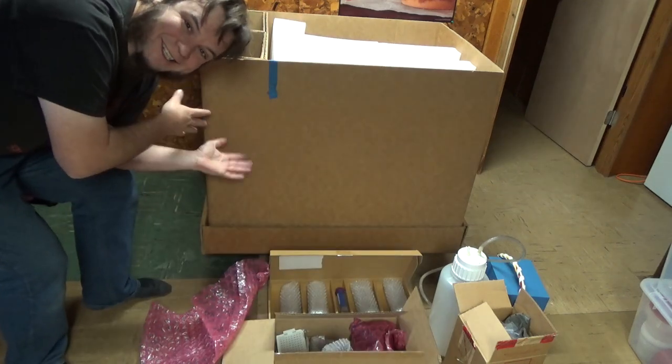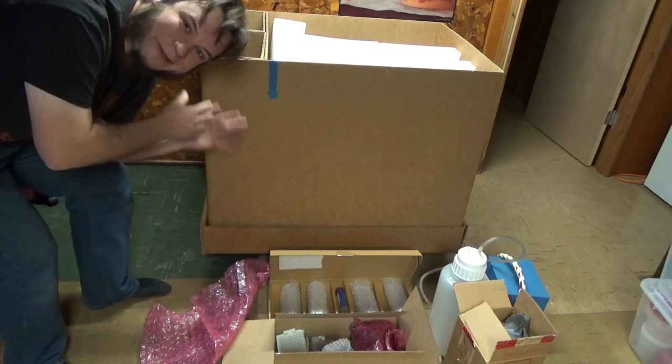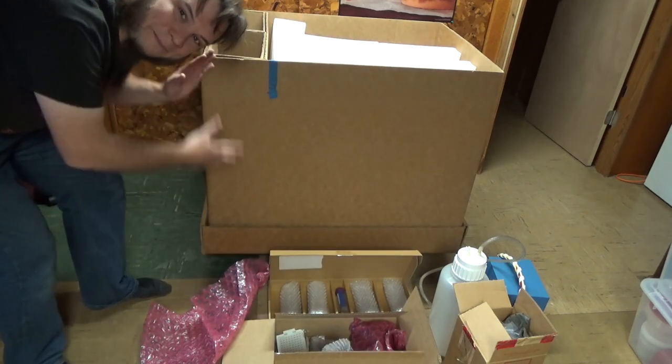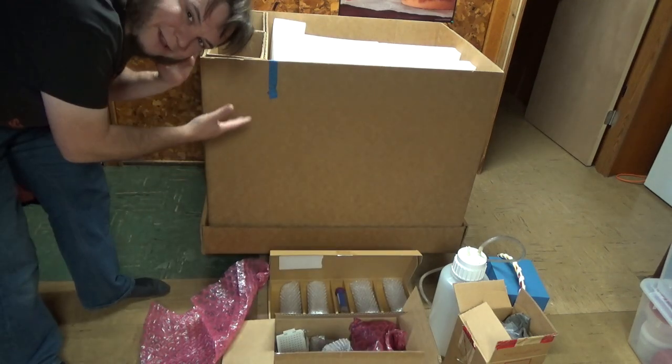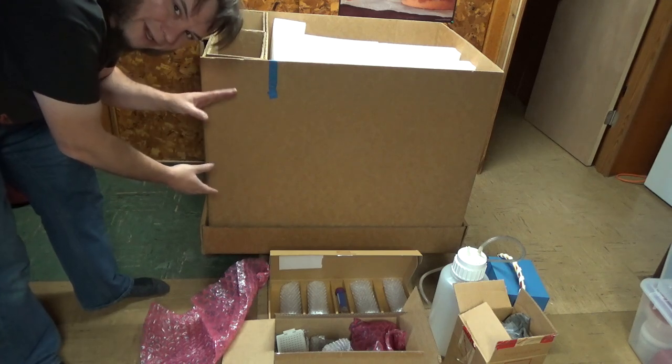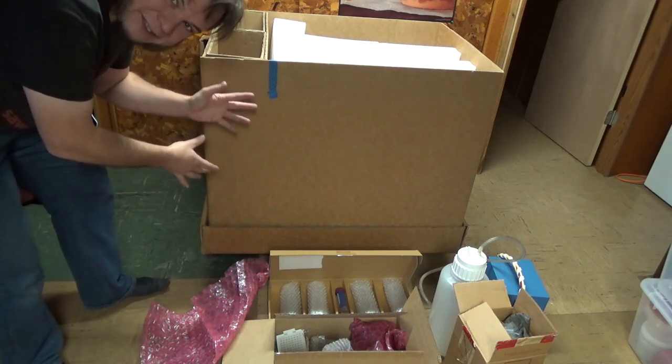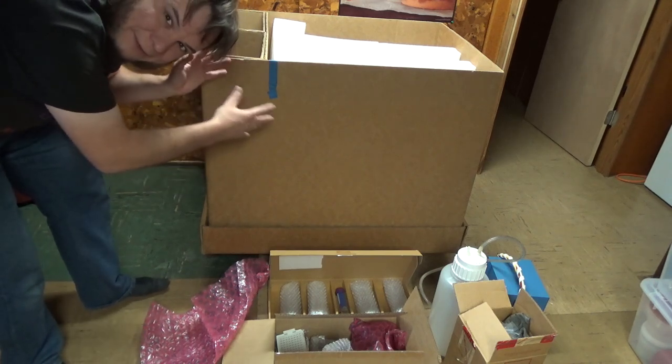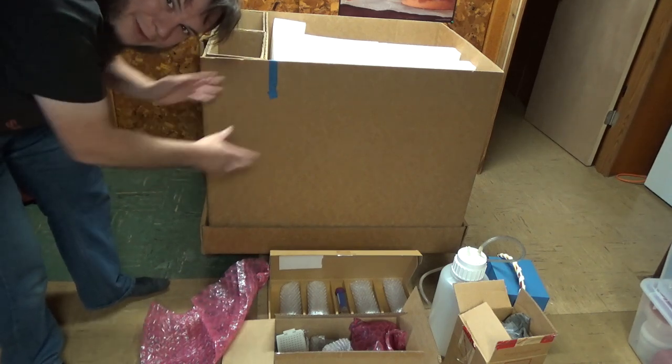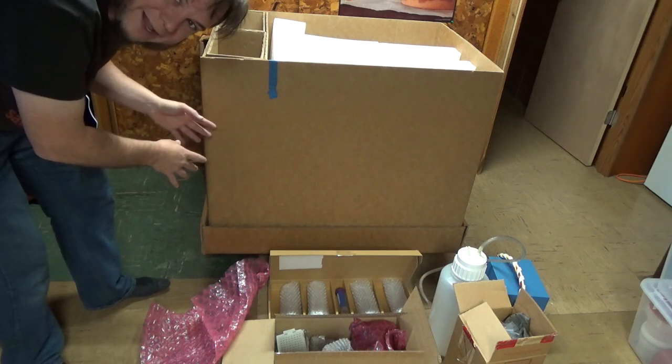Okay, so we're still getting to the guts of this thing. The actual lab unit or sequencer unit that's inside this crate. Let's see if we can get the whole box apart and look at it.